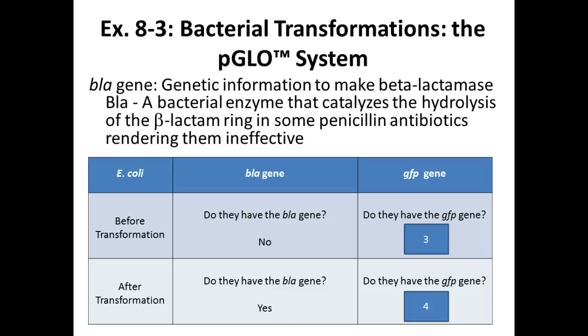Can I interject a comment here? When we introduce the plasmid, it actually takes a lot of energy to reproduce that plasmid, and a lot of cells would normally spit it out. It wouldn't be worth their while to keep it. But because it has an antibiotic resistance gene, and you put it on a plate with that antibiotic, there's good reason to keep that plasmid. That's the selective pressure that allows that plasmid to stay.